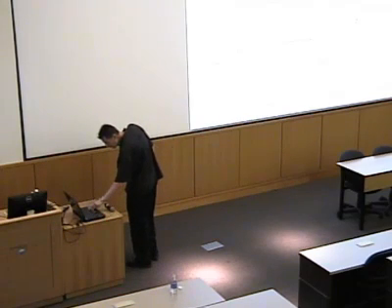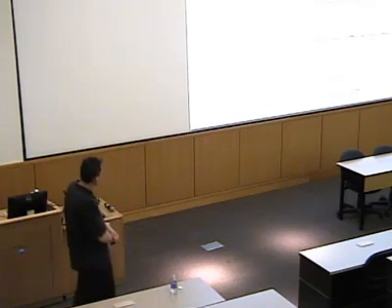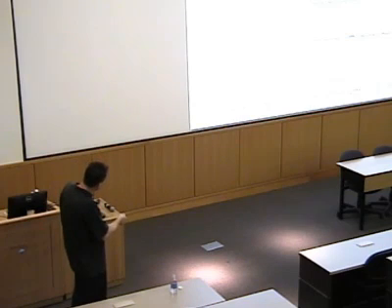We went on to, this is just a summary, but we go a little bit faster now. This is the low spin case. So we're looking at the high spin state here. The low spin case, you can see, looks completely different, a lot more MCD intensity. And then here we just have the Soret band now, again, being the dominant feature. But the important part here is if you look at the low spin case, this big, intense negative band at about 28,000 wave numbers is completely missing. So this band only shows up in the high spin case.